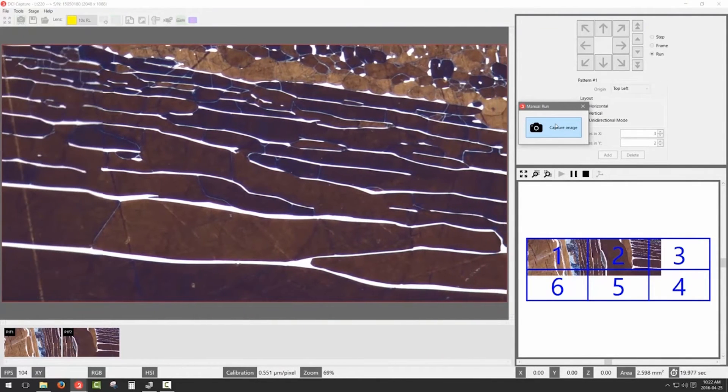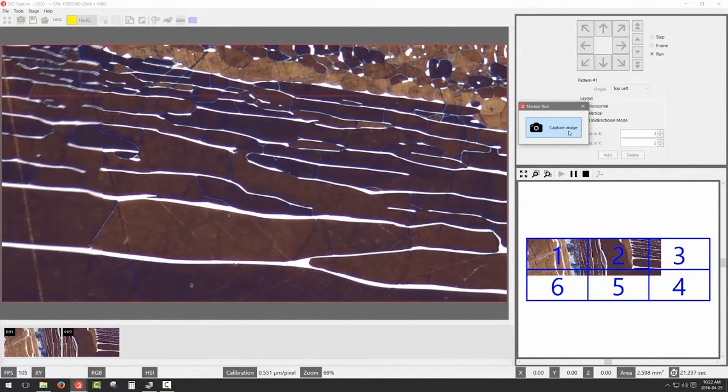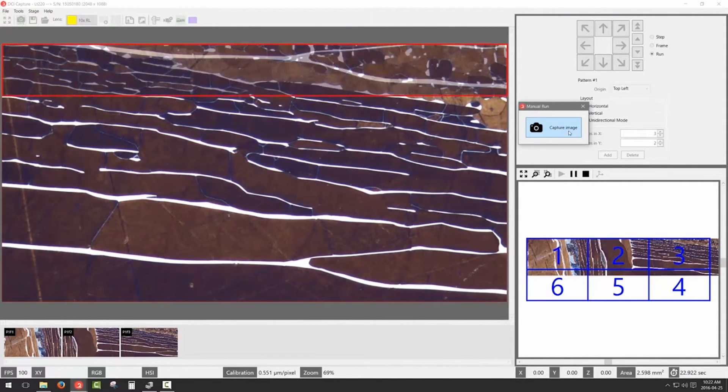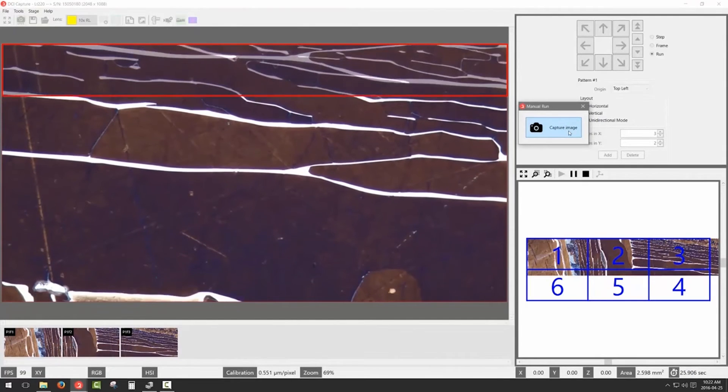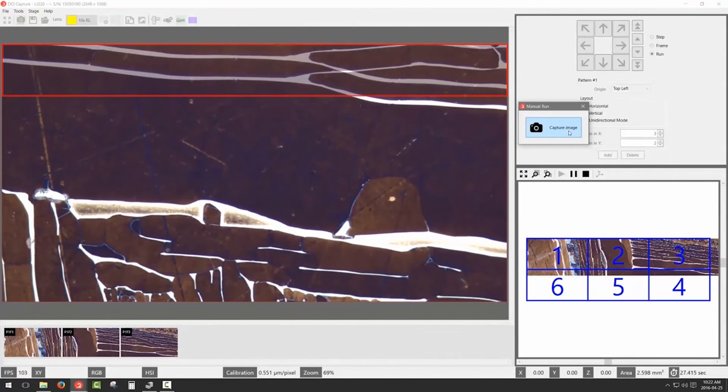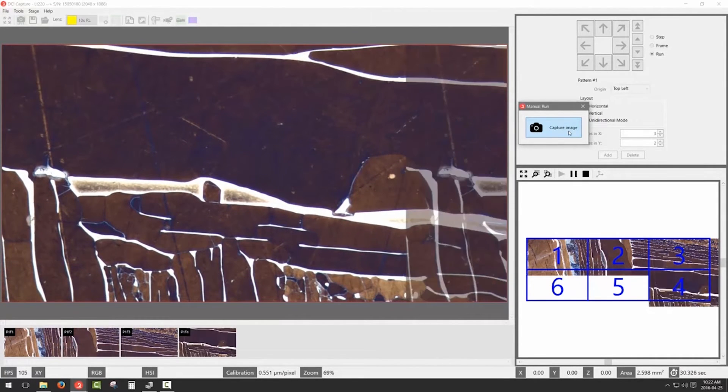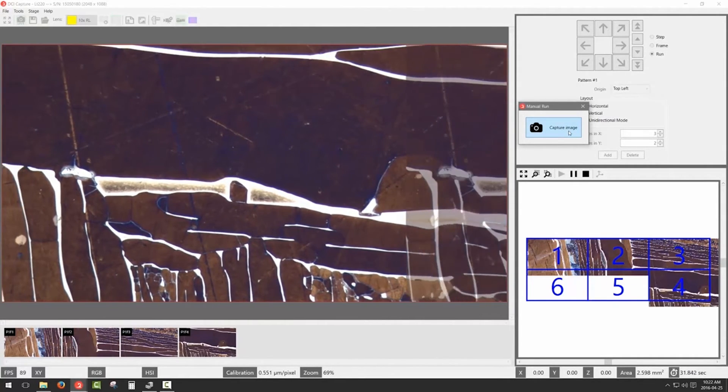When you are changing direction, so will the overlay. Use the same technique for up and down movements instead of left and right.